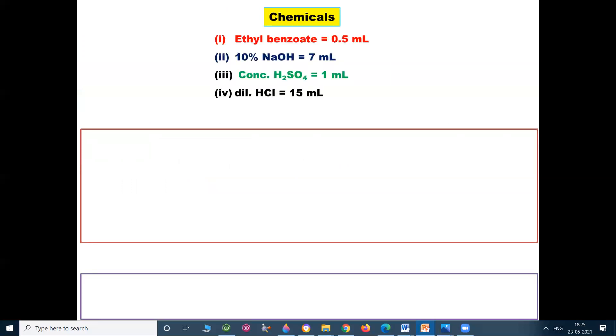For this experiment, the following chemicals are required: ethyl benzoate 0.5 ml, 10% NaOH 7 ml, concentrated H2SO4 1 ml, dilute HCl 15 ml.